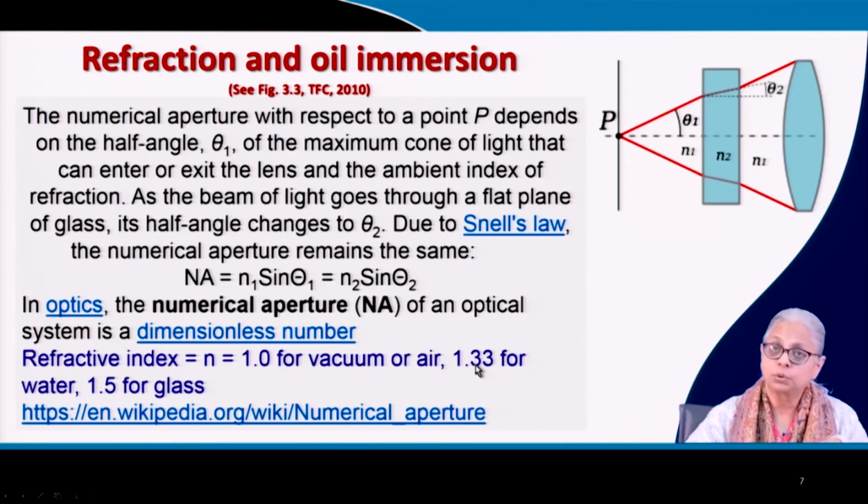Now, immersion oil, not emulsion, immersion oil is a special oil. You can't use any oil that you have around you. No, it is created specifically for this purpose. It is ultra high purity and it has just the right refractive index.